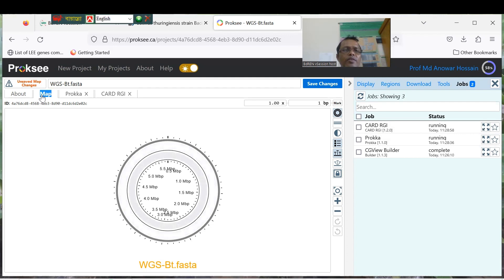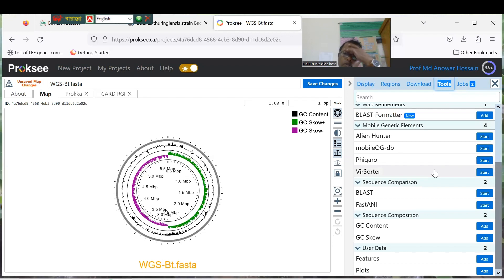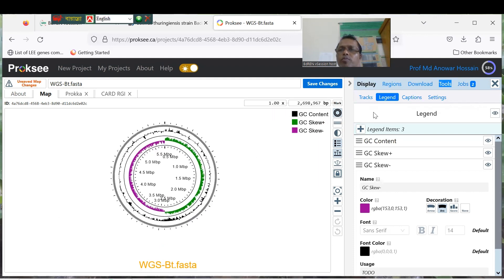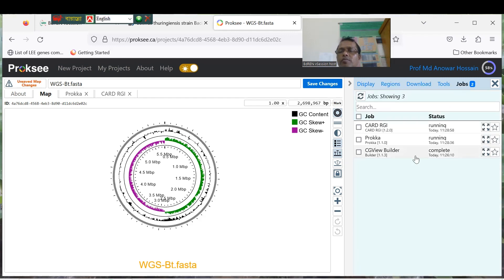You can see the CGViewer map with GC skew and GC content layers added. You can add GC skew (plus and minus) and GC content from the tools menu. You can set up your genome map and wait a little while for everything to complete.